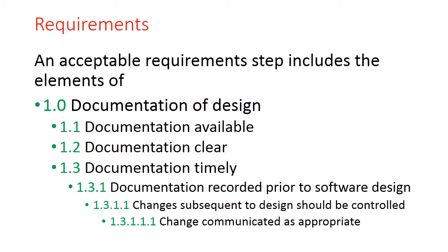That clarity should be there before we start developing the LIMS software. So the document pertaining to all aspects of software design should be available. Then the documentation should be clear, so again there will be no ambiguity regarding any step or instruction written in this document, and the document should be available properly before the development process starts.